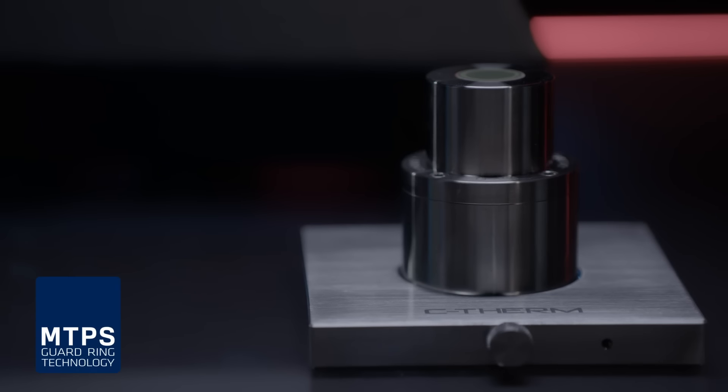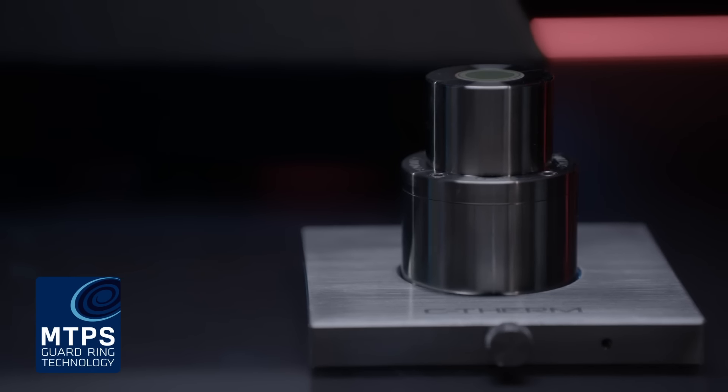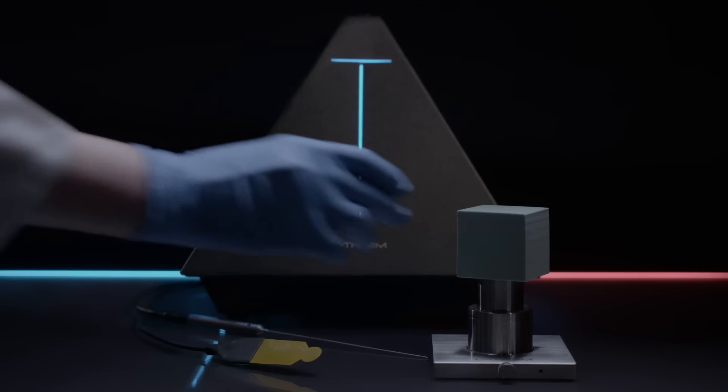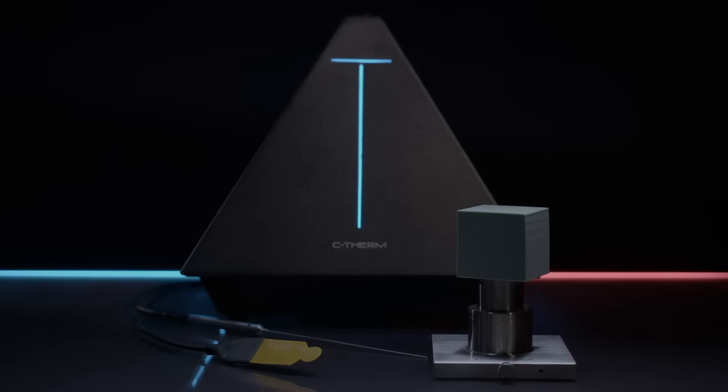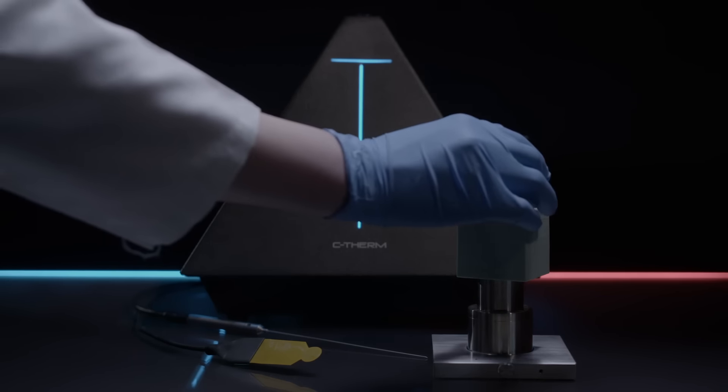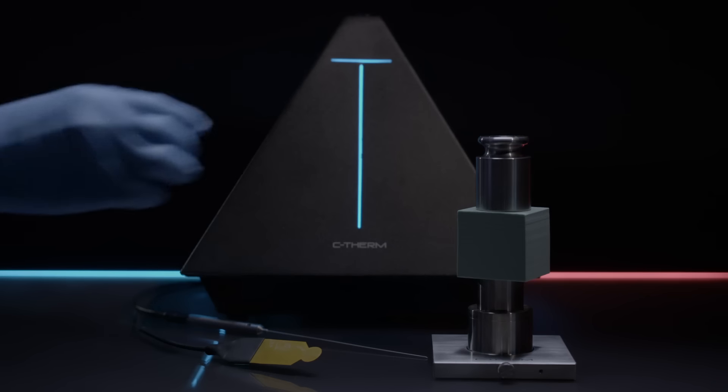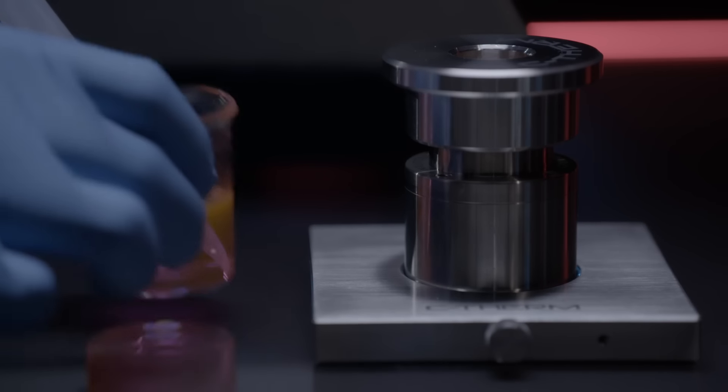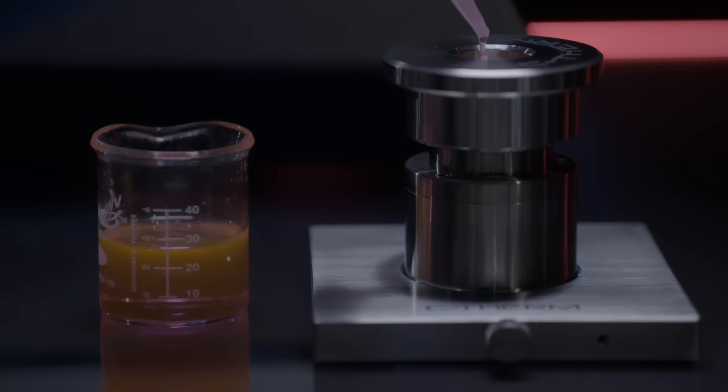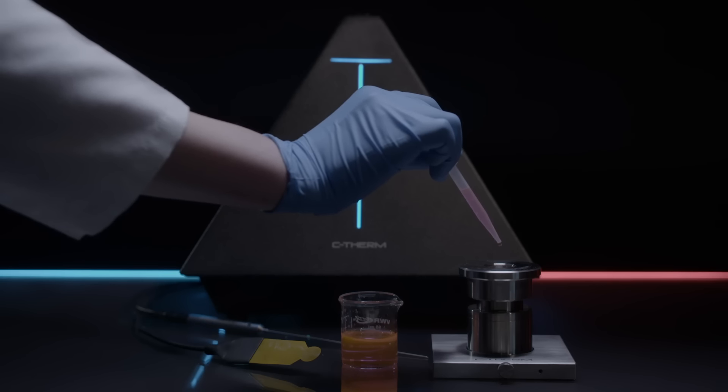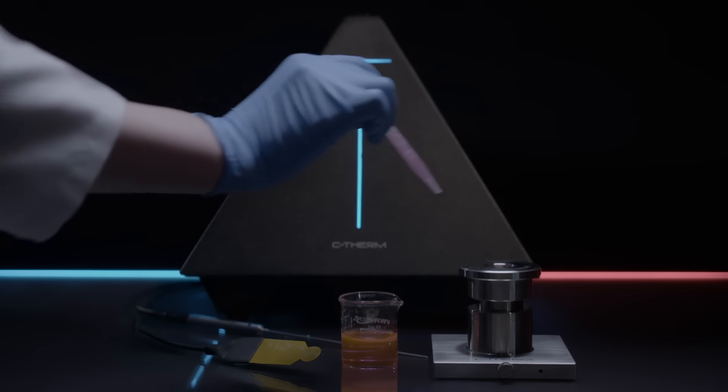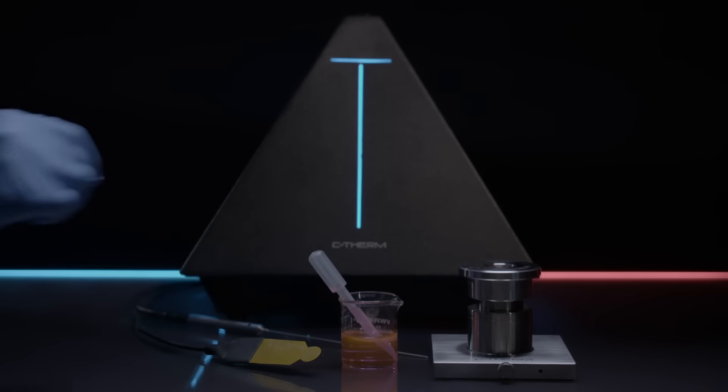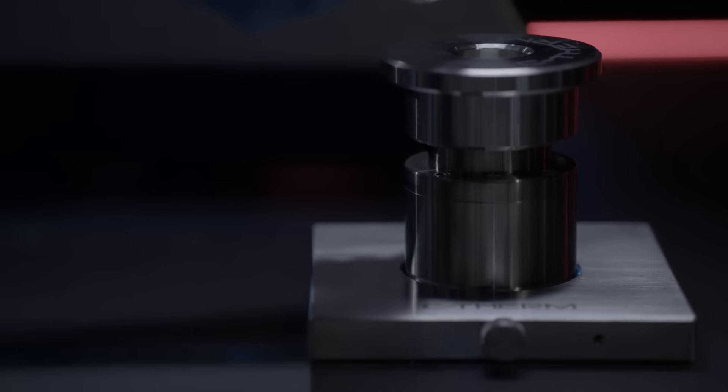The MTPS, Modified Transient Plane Source method, employs a single-sided sensor to directly measure the thermal conductivity and effusivity of materials. The method features the highest precision and sensitivity, providing accurate test results in seconds. It offers the maximum versatility for the non-destructive testing of solids, liquids, powders and pastes.